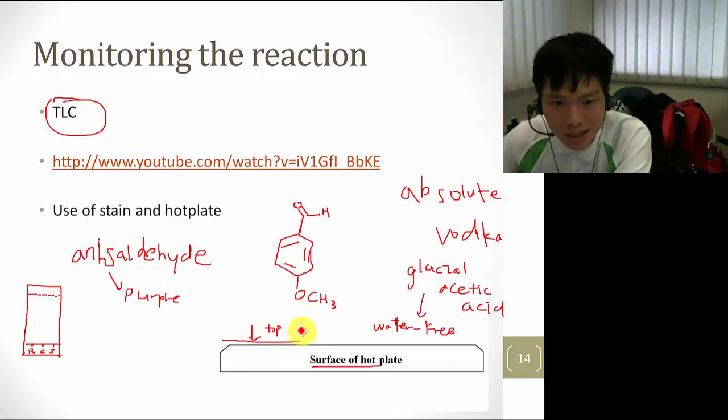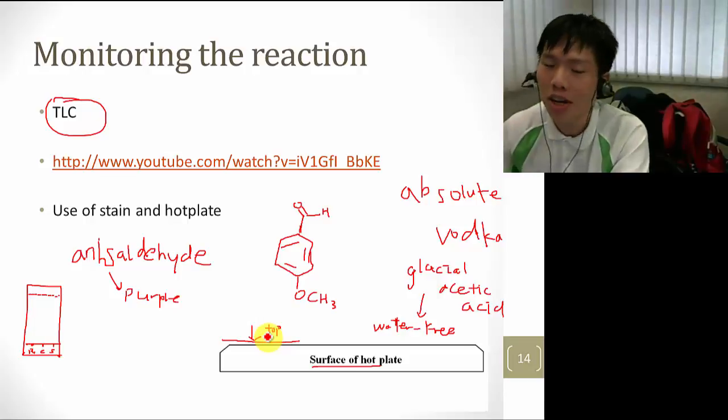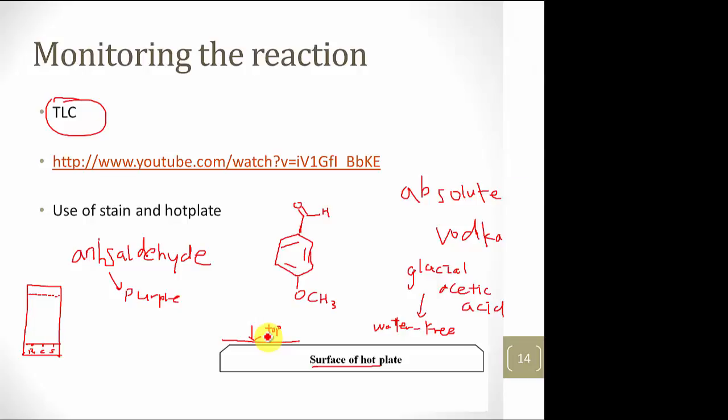Monitor the TLC plate as it changes color. You can't just leave it to go for a lunch break or toilet break and come back to see it's all black. There was a case, I think, where sparks were seen for some of the students who did this.